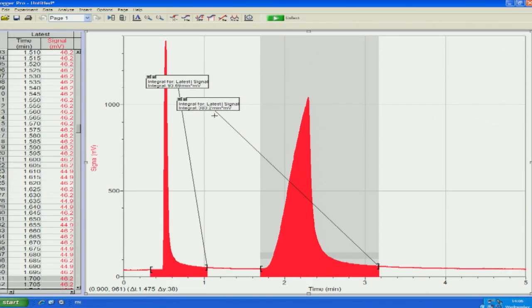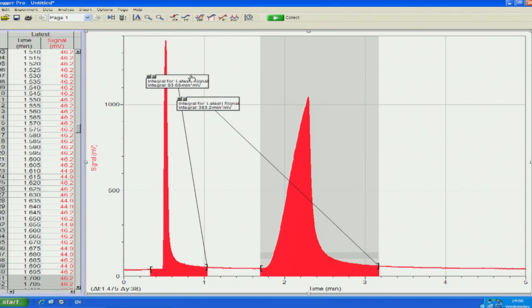Integration is the area under the peak and you will want to measure from approximately where the peak starts to where it ends in the baseline to the best of your ability. The number that is produced is the integrated area. Be sure to record these values. You will need to compare these values within the same chromatogram to extract any valuable information. Therefore, it does not make sense to integrate just one peak.